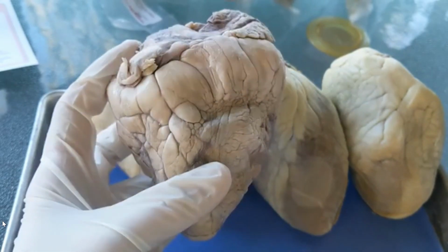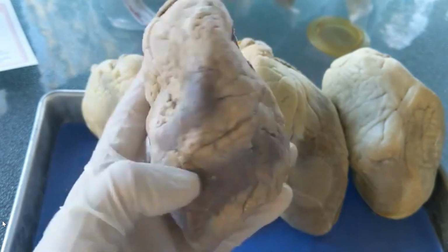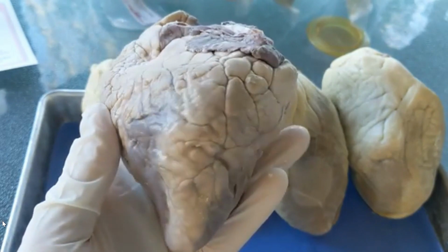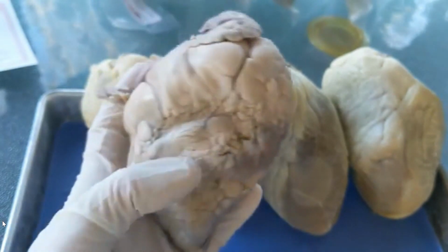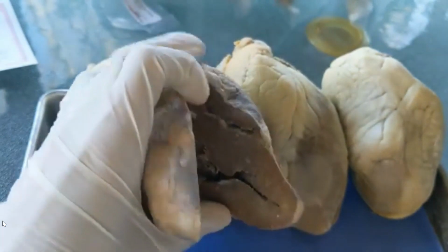See if you notice anything irregular about the coronary arteries and the back of the heart. Again, the main thing we're looking at is the coronary arteries. Do you notice any blockages in any of the arteries? And then we're going to open up the heart.